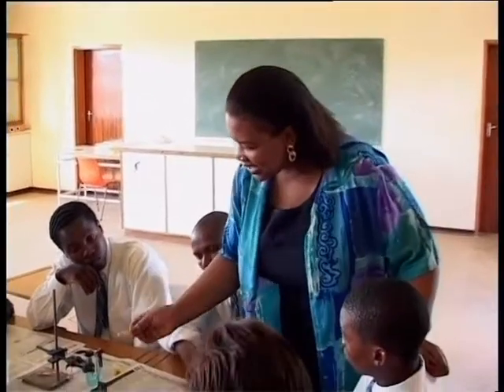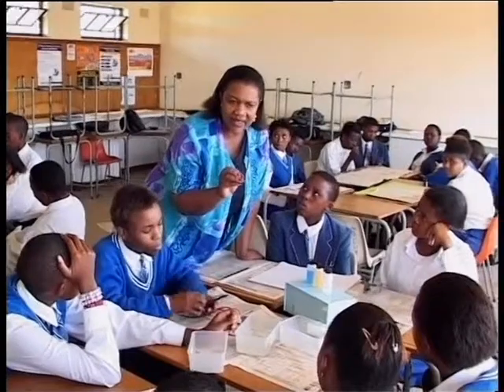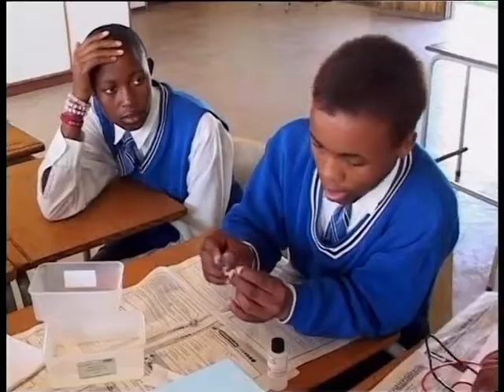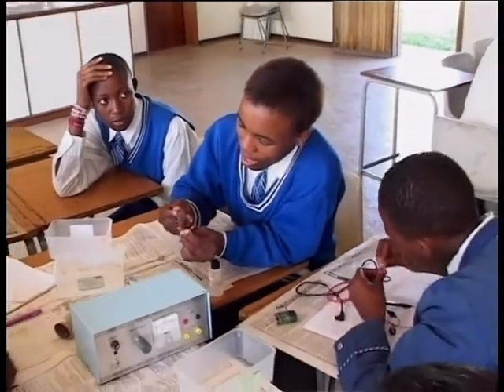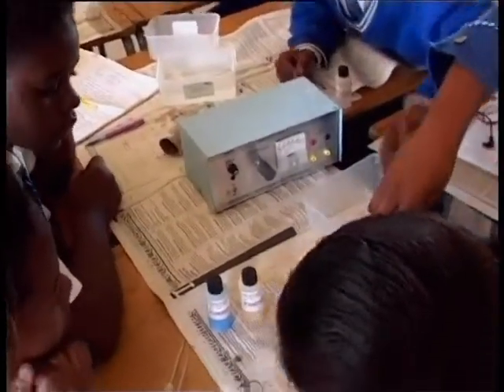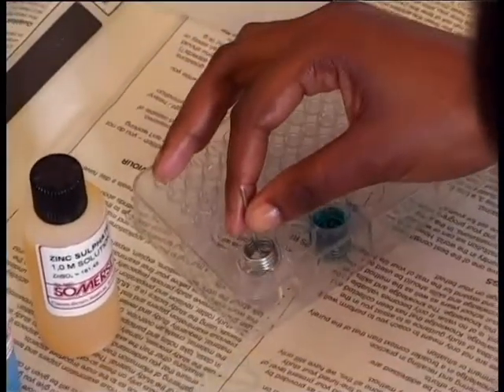The advantage of using a circus of activities is the fact that you can set up many experiments in one day and have the students manipulate all sorts of experiments. Like in our circus today, we had 3 experiments where the students were able to observe all 3 experiments in one day. It is important for the learners to set up the experiments themselves, to get a hands-on experience of the equipment and chemicals and make their own first-hand observations. Copper sulfate, and then we take this one and put in the zinc sulfate.